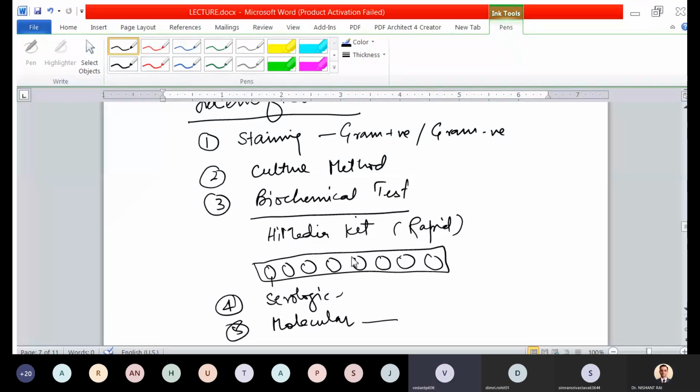सर जैसे हमको काउंट करना है अगर बैक्टीरिया को, तो हम उससे भी तो काउंट कर सकते हैं, पेट्रोफ हाउसर काउंटिंग चैंबर. No, we are actually counting the colonies, not the bacteria. Right? They're two different things. We are here counting the number of colonies, right? Colonies on the plate.